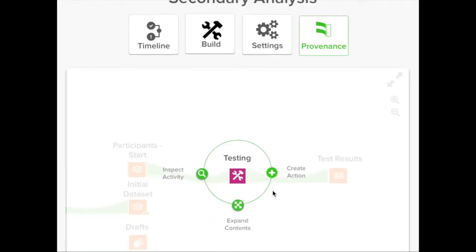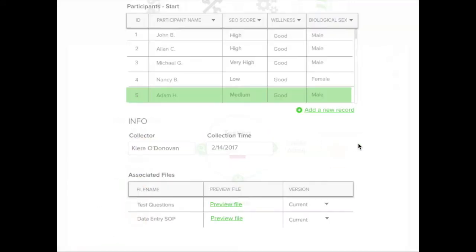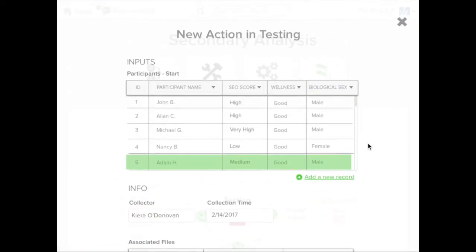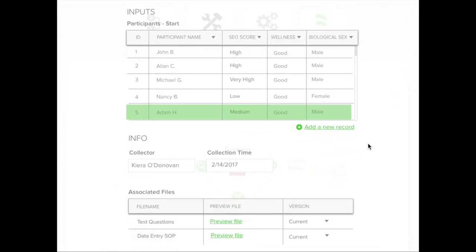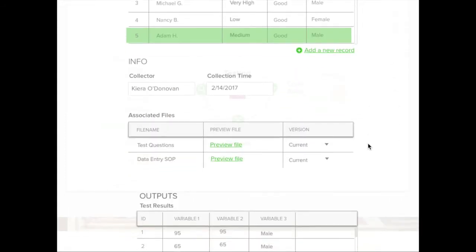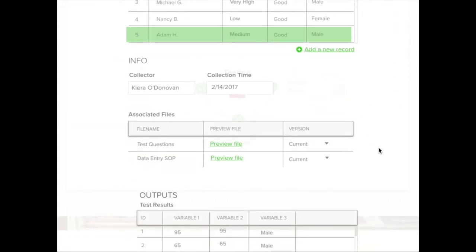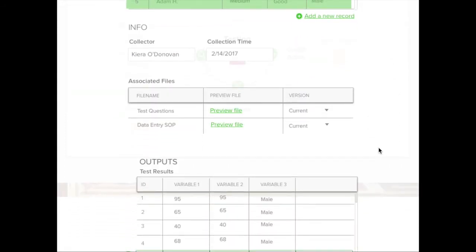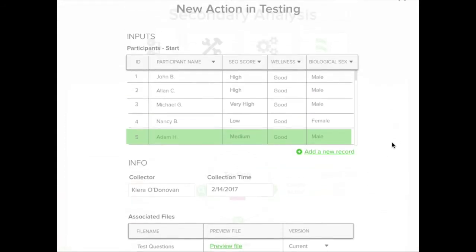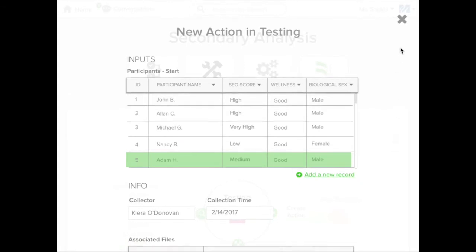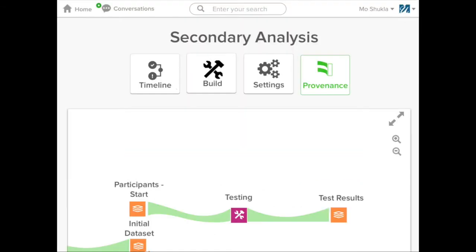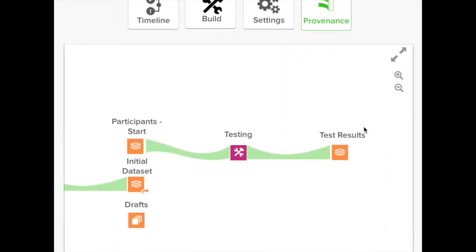Record your experiments and analyses in Ovation or connect it with the lab software you already use in order to automatically record your activity. Capture the data you started with, the data that resulted, and the materials and protocols that got you from A to B.